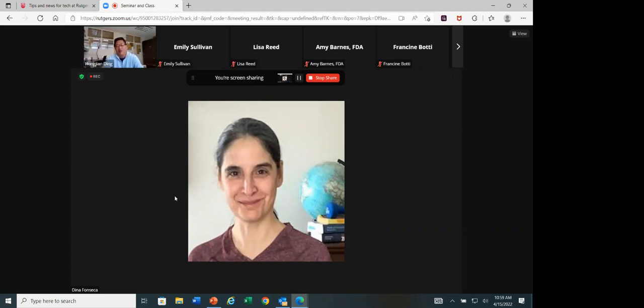Right. So this is where the image analysis can identify to species, not just saying there's chitin. Yeah, there's chitin or there's keratin, but what species is it? Okay.